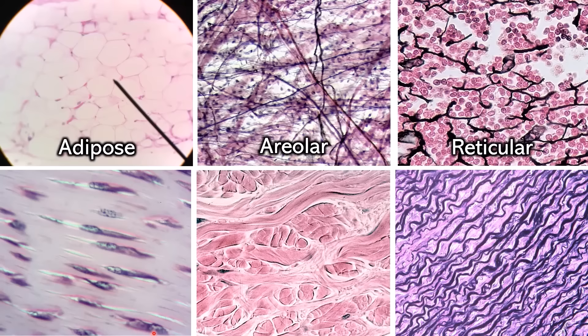It's called regular because the fibers are running in one direction. Next door, we have fibers running in many directions — some fibers running this way, and then a bundle of fibers that was coming straight at us and got cut, so we're seeing the stumps that have been cut. Because these collagen fibers are running in many different directions, this is dense irregular connective tissue.